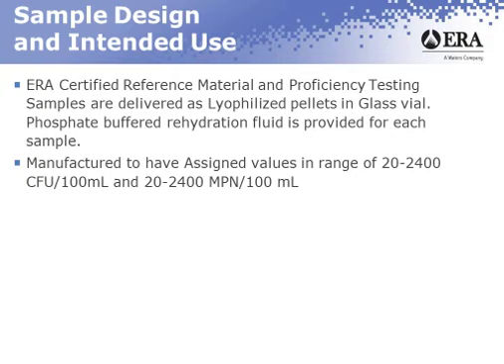For the non-potable water, ERA has their coliform sample, which is designed in the 20 to 2400 CFU or MPN per 100 mL range. They also have an enterococci that is designed within the 20 to 1000 CFU or MPN per 100 mL range. Remember that these are the design ranges, they're not the range of acceptable results.